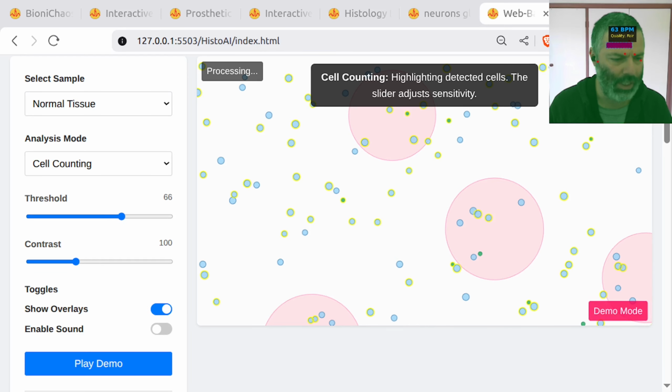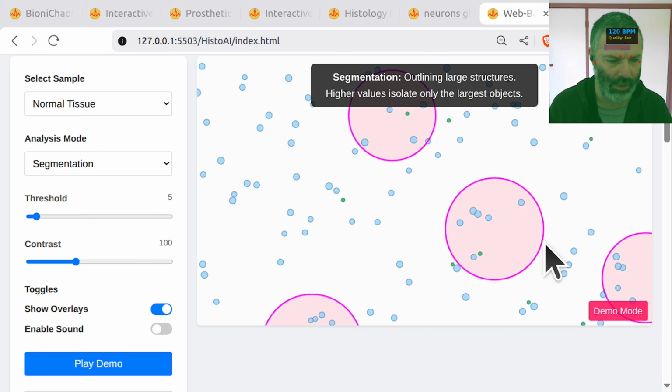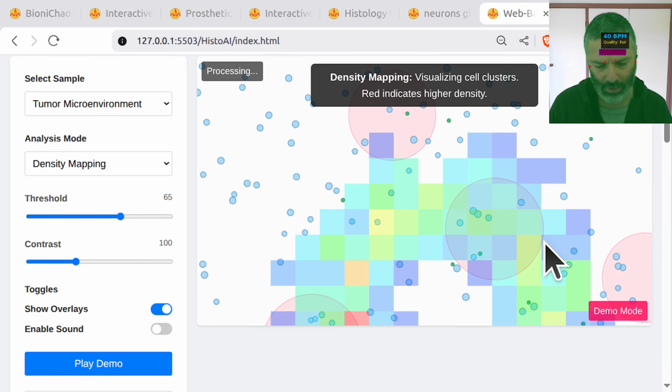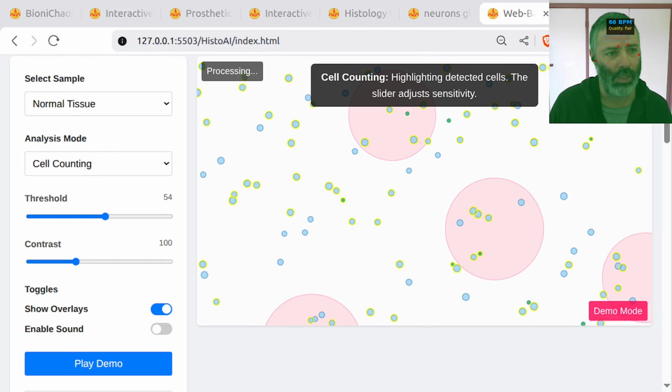Wait, without changing the input images, so we want to use the synthetic data, that's fine. How do we make sure the analysis is actually correct, even if the data is synthetic? So sorry, so just like rephrasing it. I know I've been asking the same question over and over again, but can you explain it in detail to a beginner?